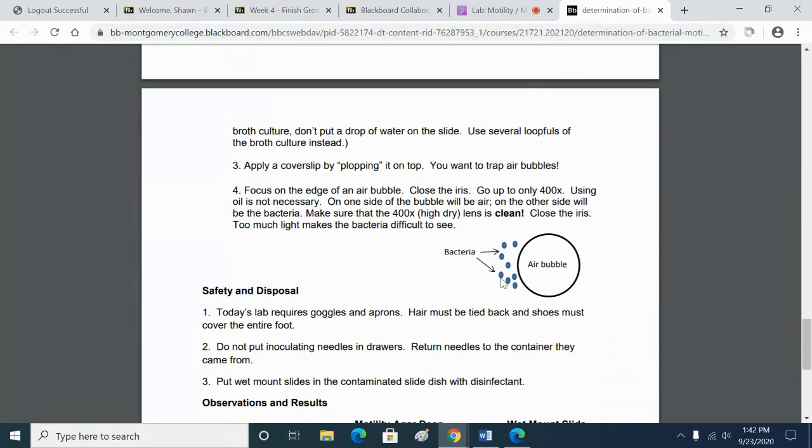And then you've got to sit and watch and say, okay, are these bacteria doing anything purposeful? Or are they just randomly vibrating? And it's not that easy to tell. When you look at something like Staph aureus, those cocci are just bobbing around and vibrating like crazy. It looks like they're motile, right? It looks like they're moving, but it's all random vibration. But they really do look motile.